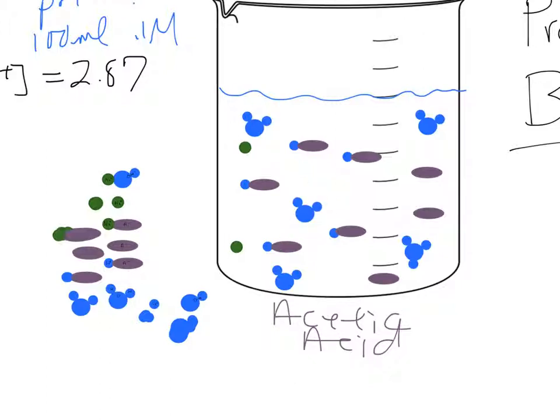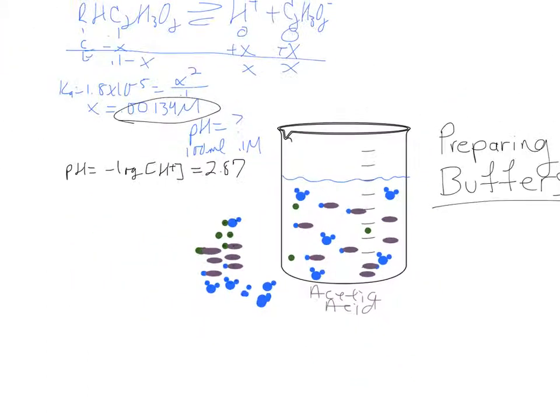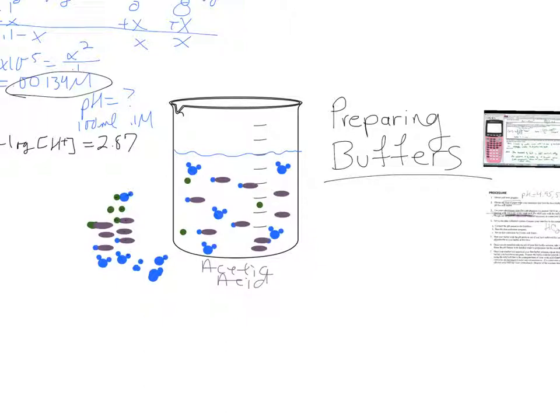And we are going to have that happen for every sodium acetate that we add. We're actually adding an acetate ion that could react with hydroniums and a spectator sodium that's just going to be there. But every acetate that we have could take away a hydrogen from those hydronium ions. And in that way, we're going to be reducing the number of hydronium ions, which is what will cause that pH to rise. So that's how we're going to cause our change in pH, and that's how you calculate it. That's show me the chemistry. That's the chemistry that's going on in the beaker.